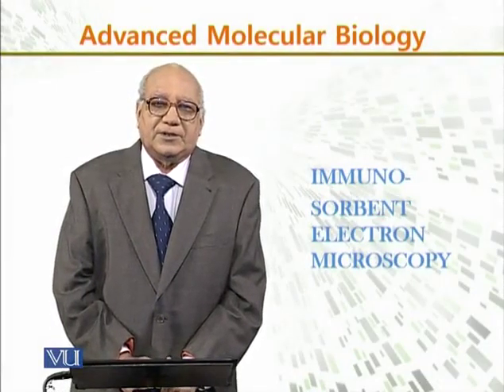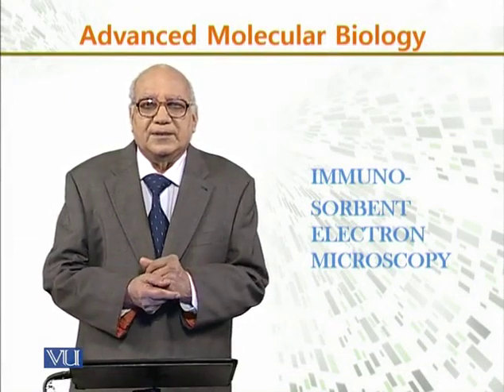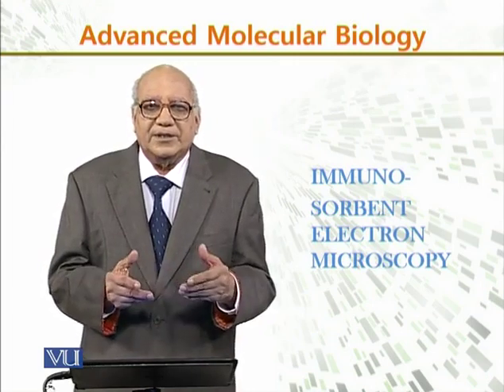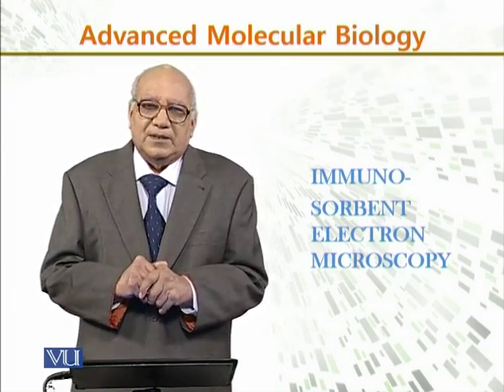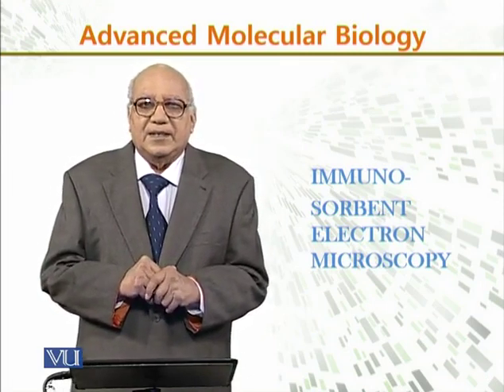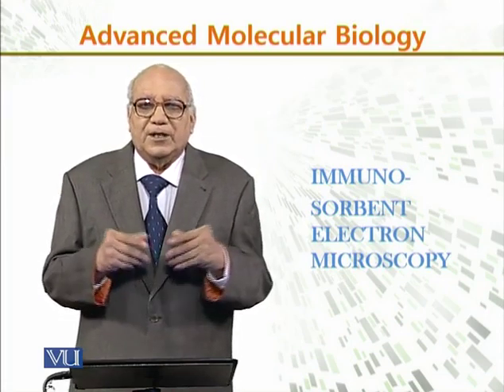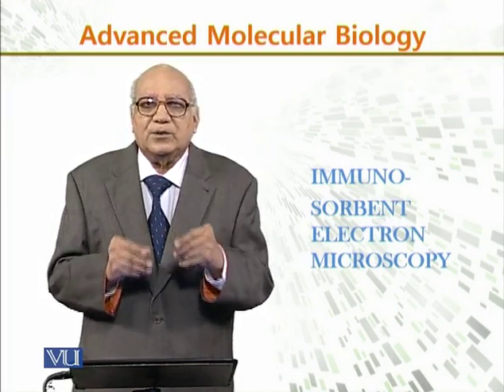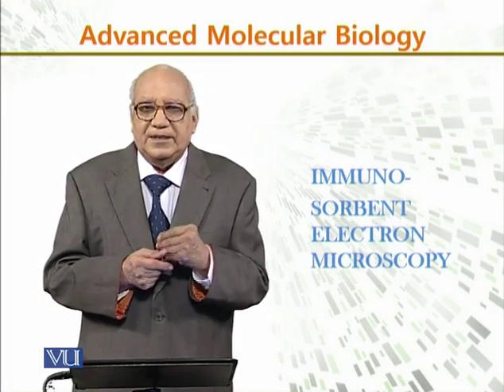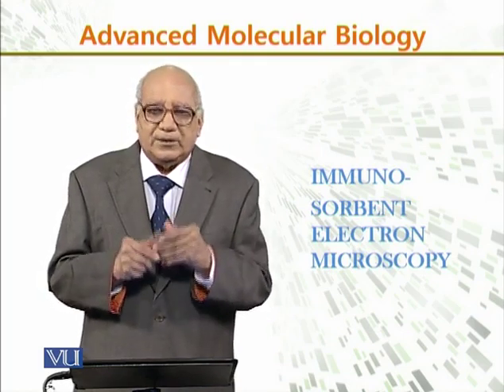Different techniques are used in advanced biology to study cells, viruses, and bacteria. In this segment, we will discuss an important technique by the name of Immunosorbent Electron Microscopy, ISEM. Immunosorbent Electron Microscopy.